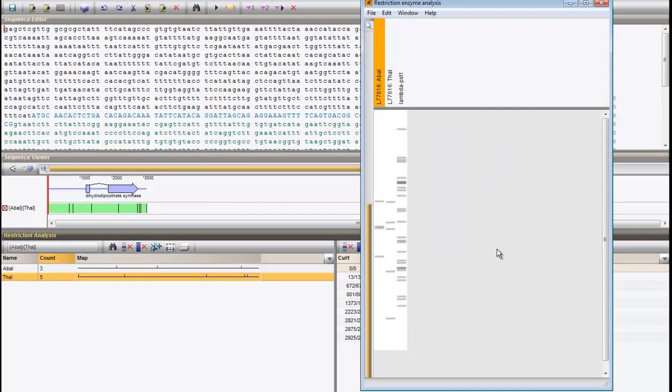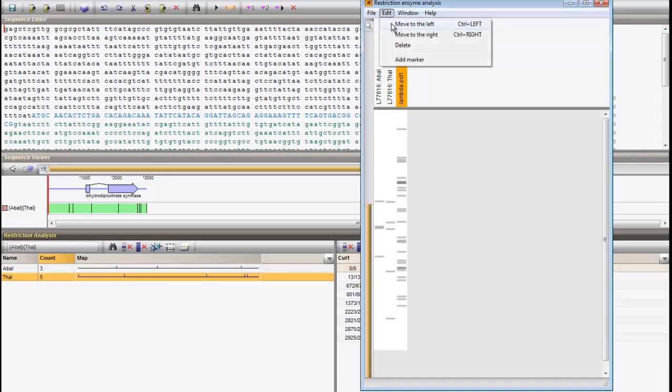The position of a gel pattern can be changed with Edit, Move to the left.